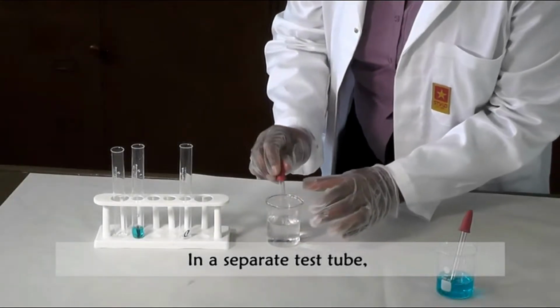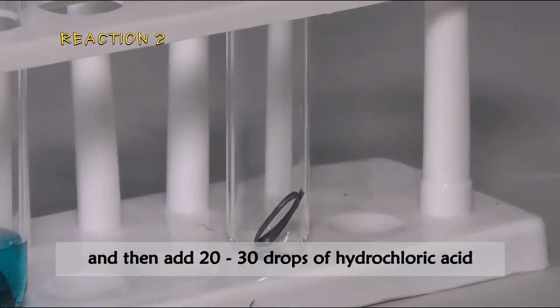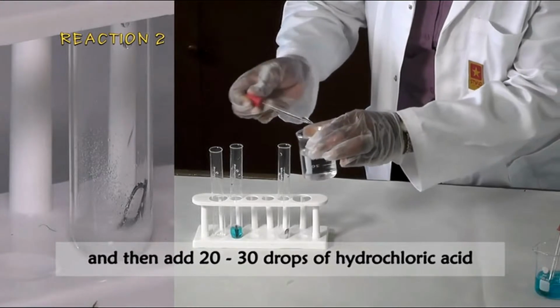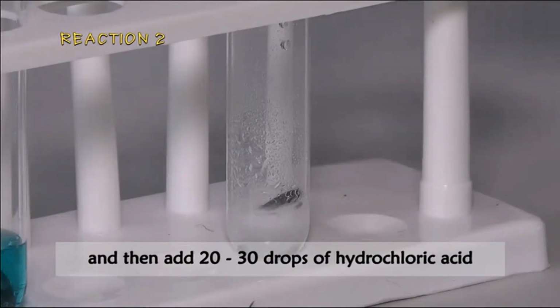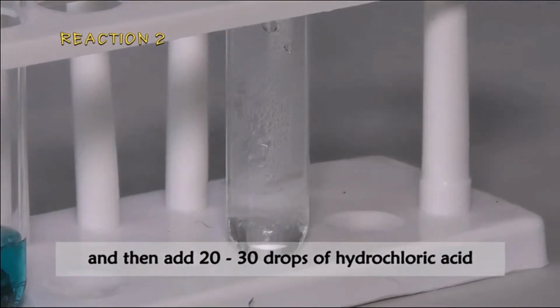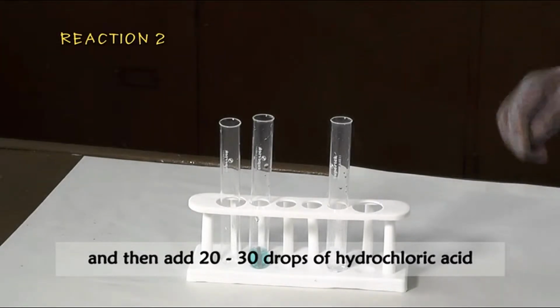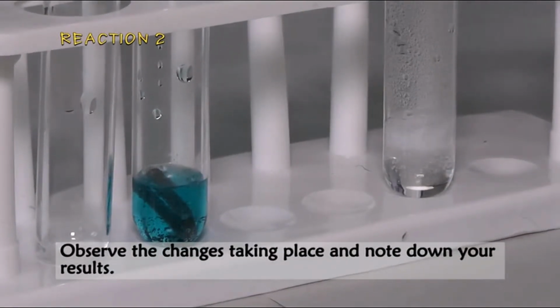In a separate test tube, add magnesium ribbon and then add 20 to 30 drops of hydrochloric acid. Observe the changes taking place and note down your results.